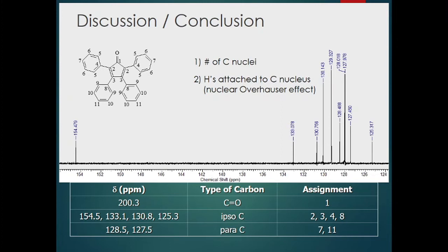Although you'll notice from this spectrum that we do indeed have two peaks that are not overlapping, but these two peaks are very, very close. Overlap is rare, but it can and does happen. The fact that I'm even mentioning it should be taken as a hint. To determine whether or not a peak is in fact overlap, you do need to use a bit of logic. In identifying such a peak, look at one that is unusually large.